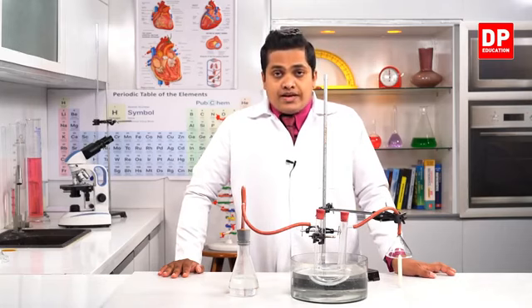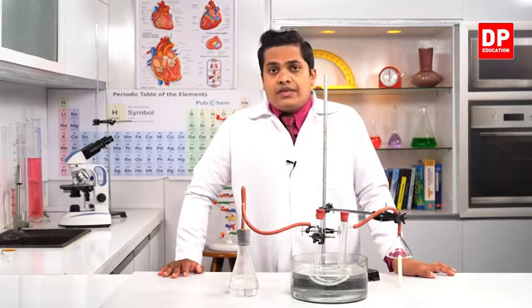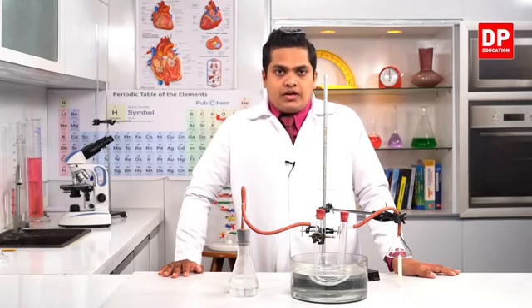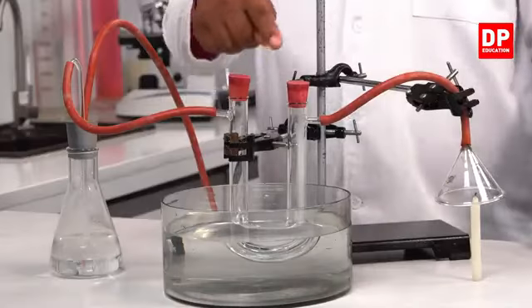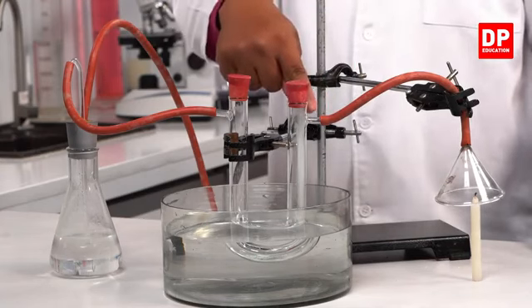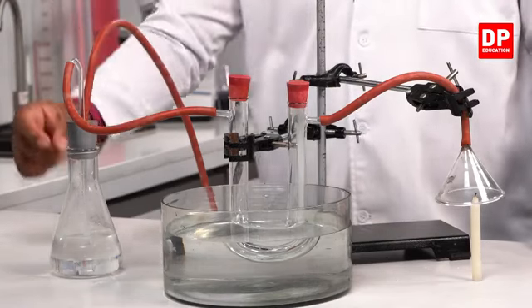When water vapor gets absorbed by copper sulfate, its color turns back to blue, the original color of copper sulfate. But in order to do that, it should come in contact with water vapor, and the water vapor should absorb into the copper sulfate crystals. Finally, the smoke coming from the candle goes through this delivery tube to the U tube, then from the second delivery tube towards this vessel.